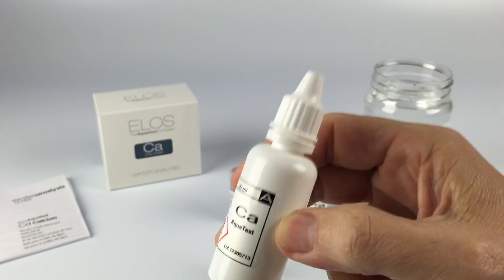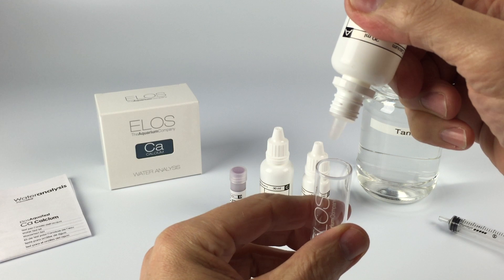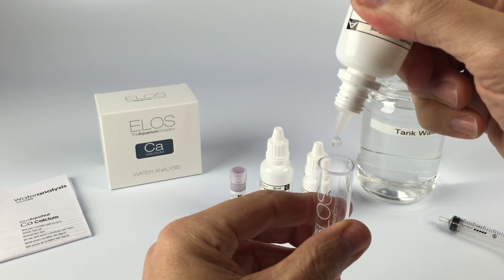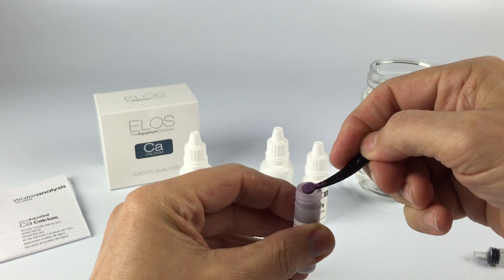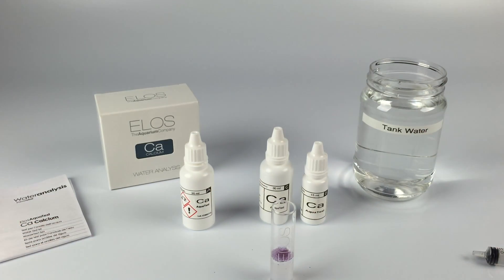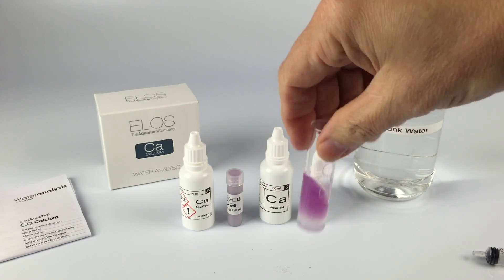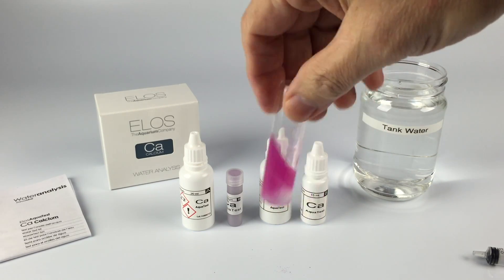Shake Part A for 15 seconds and add 7 drops to the vial. You do not need to mix the solution at this time. When you add the powder, get a good scoop of the 0.15ml powder. This is a color reagent so the exact amount does not matter. Now stir the solution for about 10 seconds — you want to get it evenly mixed, but all the grains do not have to fully dissolve.